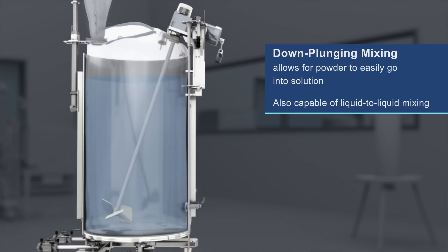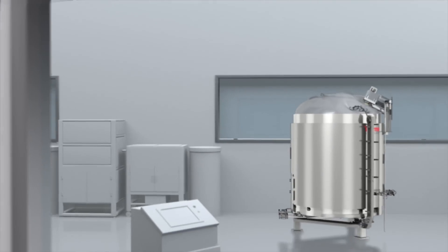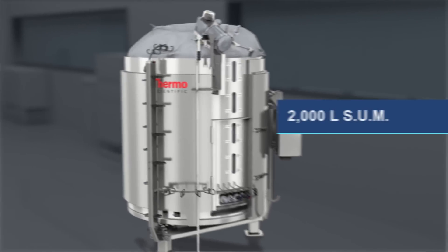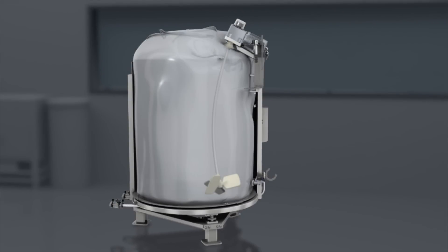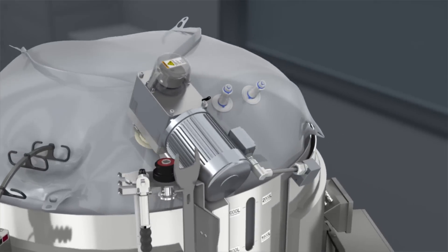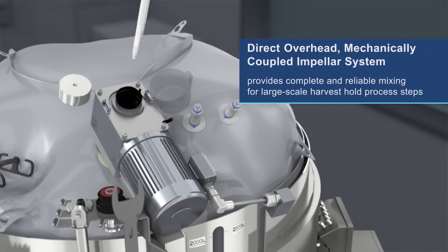The down-plunging mixing helps powder to easily go into solution. The directly overhead mechanically coupled impeller system enables complete and reliable mixing for large-scale harvest hold process steps.